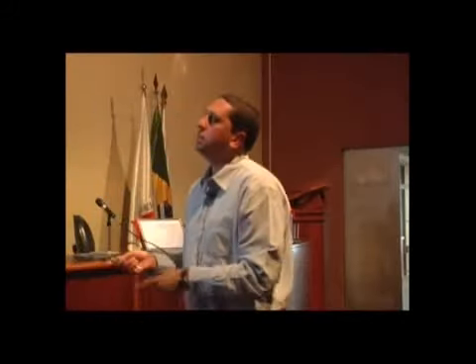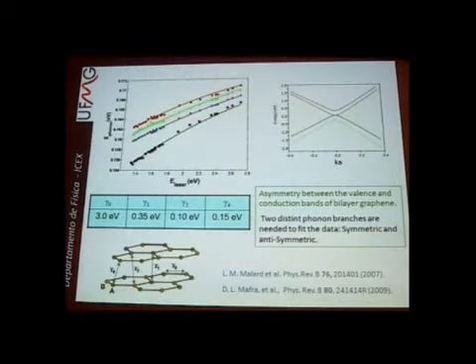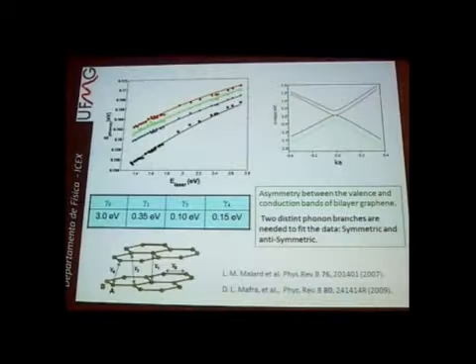So this is the assignment by changing the laser energy. This is the phonon energy. So we have four peaks, and we can take the electronic parameters and also phonon frequencies from Raman spectroscopy. So Raman is a very sensitive way to probe these electronic and vibrational dispersions in bilayer and monolayer graphene.